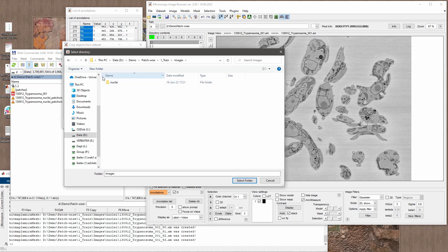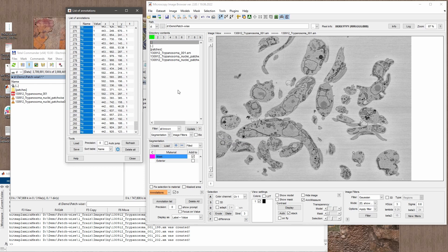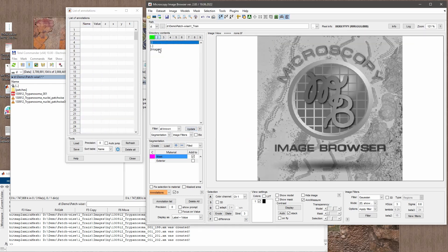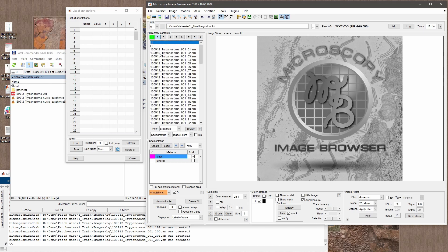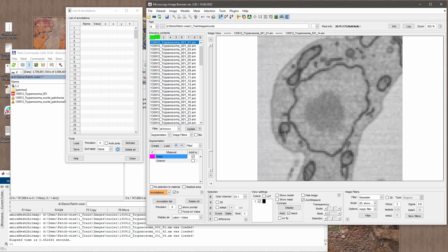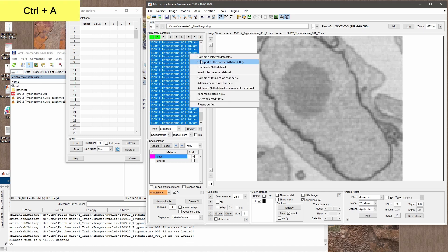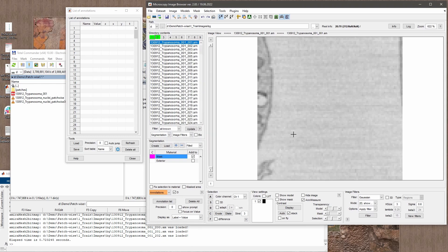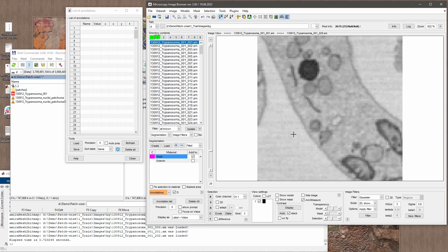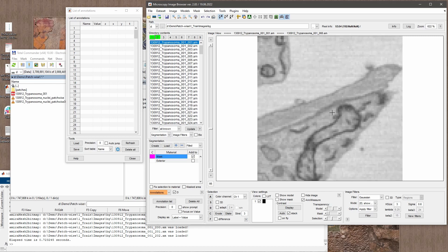It is also possible to crop 3D objects, but in this particular workflow we are working with 2D patches. After updating the view, if I go to the train images folder I have these two subfolders. Opening 'nuclei' shows examples of the patches cropped around the nucleus, and the same for 'bg' — these background patches are the different crops that will be used for training as the background class.